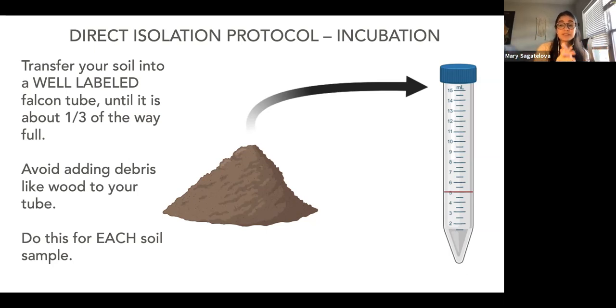Okay. So you're going to be doing this for each soil sample. So you should have 3 test tubes at the end. You're not putting them all in one, 3 separate test tubes, all very appropriately labeled.